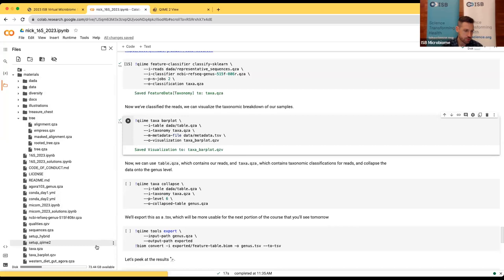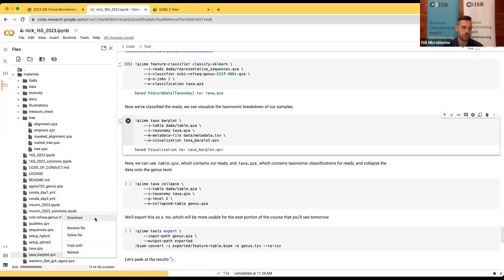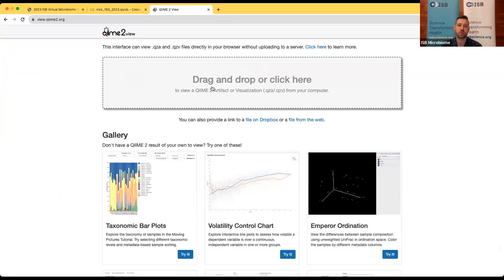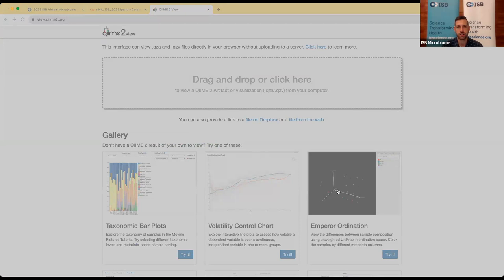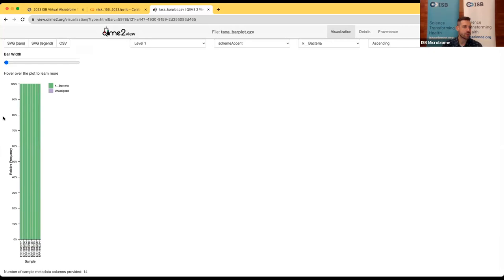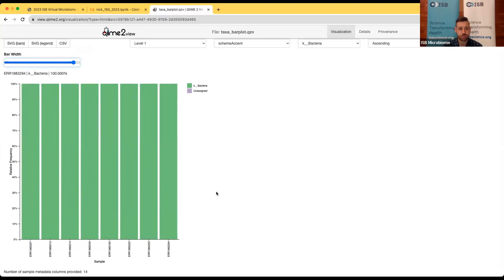We'll scroll to the bottom of our file directory and download taxa_bar_plot.qzv, then go over to the QIIME 2 viewer. Hopefully yours looks similar. Right now everything is a little cramped, so we can use the slider on the top left to increase the width of the plot. We see a bunch of green lines — QIIME automatically gives us a summary at the highest taxonomic level, so right now all our reads are classified as bacteria, which is generally what we expect.